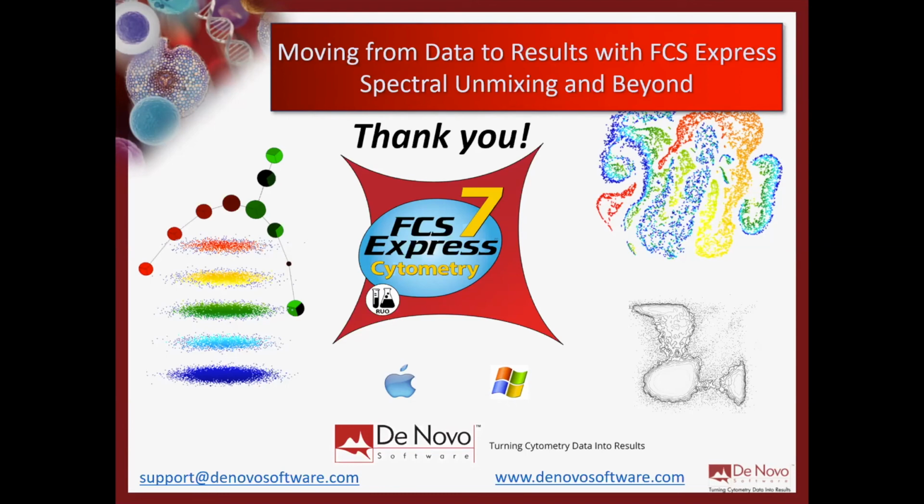So yeah, there are some minimum number of events. I guess there's nothing empirical that I can say, like you need 57 events at least to determine what the MFI value is, but really the same kind of rules that you would use for determining single stain controls for things like compensation can simply be applied to unmixing. You need to be able to figure out where your positives and your negatives are accurately. As long as you can do that, that's the minimum number of events that you need.